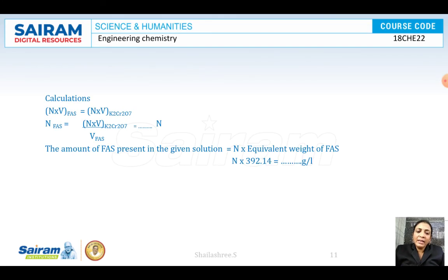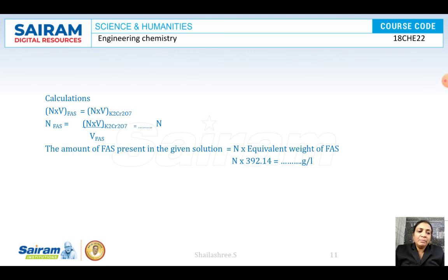The application here is that it gives 100% accurate results. 100% accurate results will be obtained in potentiometric experiments.